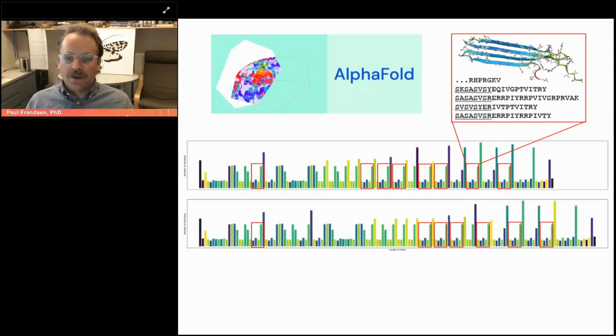And then we can understand how frequently these beta sheets show up in the gene itself, and then potentially eventually make some prediction for what the phenotype of this particular variant, or this particular allele of the gene, would look like. And what you'll notice, even between these two alleles, the density of this particular repeat really varies. And so this probably has an effect on the phenotype.